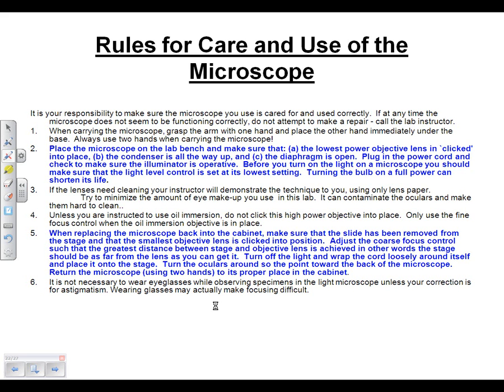And the other thing to go along with that is, most of the time you're in lab, we're going to require you to wear safety glasses, but anytime we're using microscopes, that'll be the one time when we will relent. As long as you're using the microscope, then you can have your safety glasses off also.